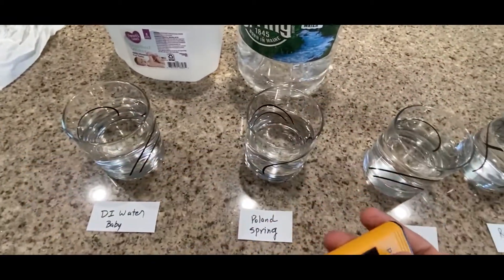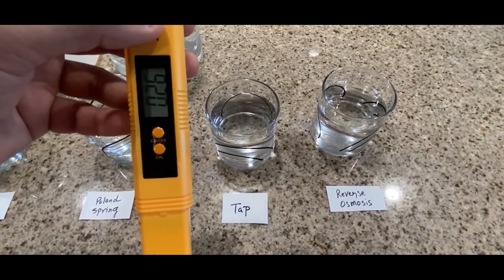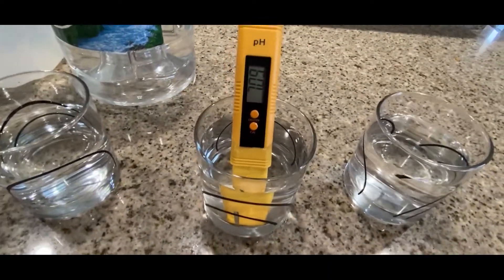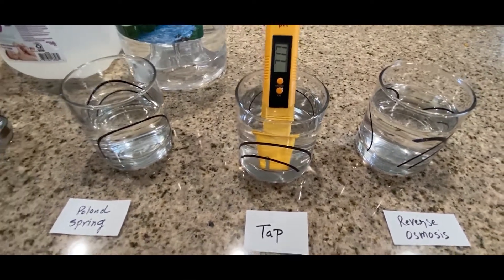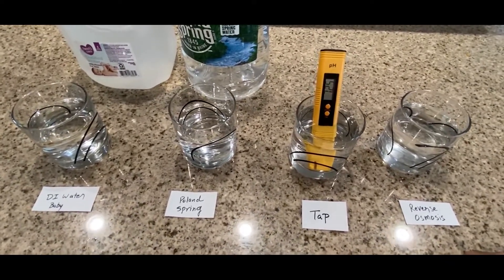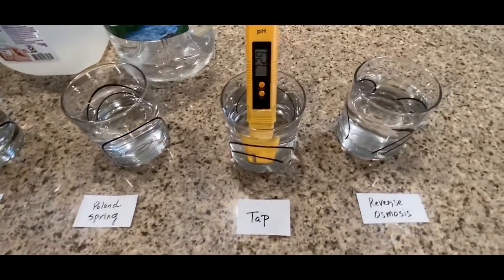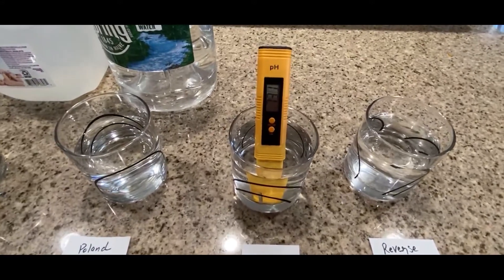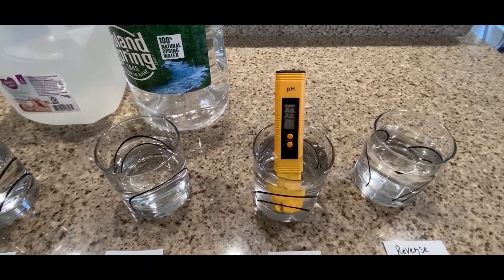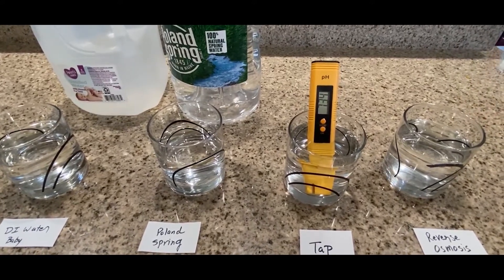Next is my tap water and the pH was around 7-something, so the pH wasn't that bad — it's just that the TDS is quite high. I could have gone with five-gallon bottles from Walmart or Home Depot, but that's too much work — changing them whenever they get empty. I just want something built in so I can drink right from my faucet. It looks like 7.33 or 7.34. Let's measure the reverse osmosis next.